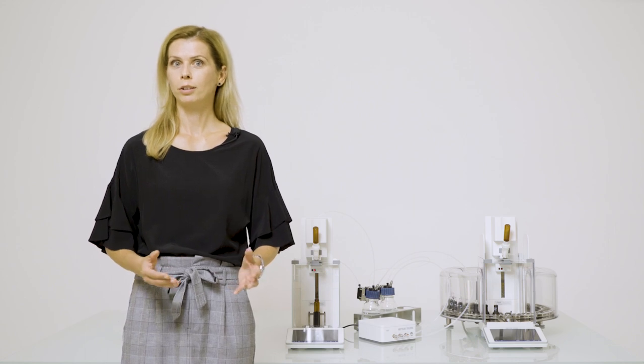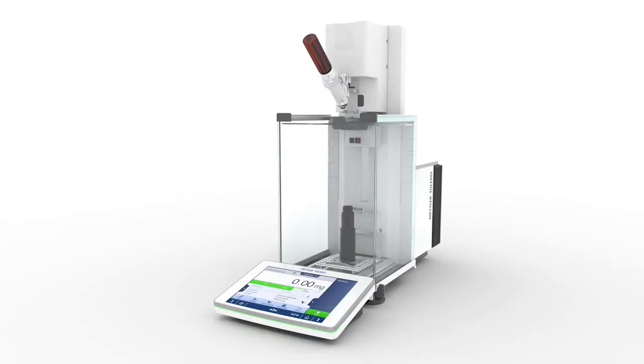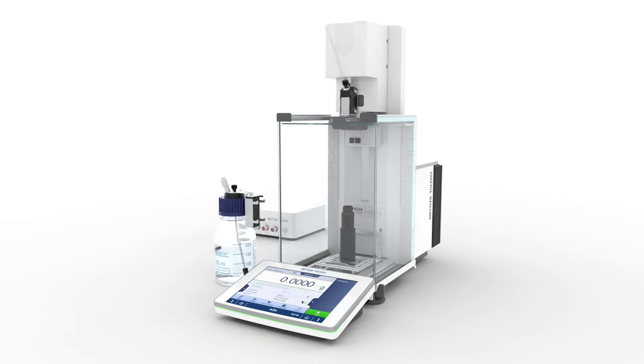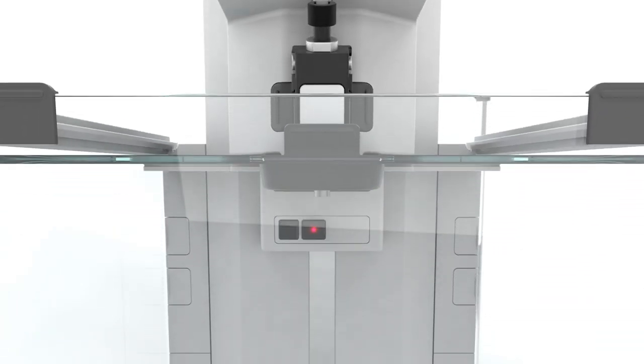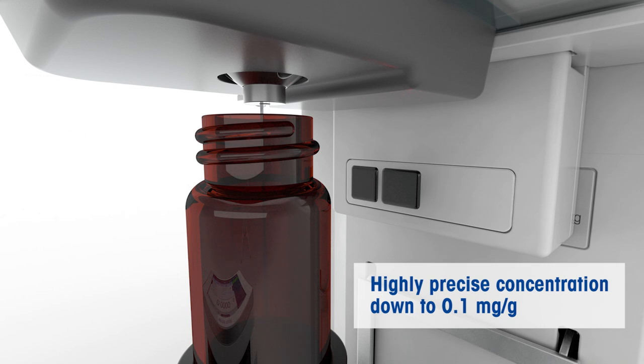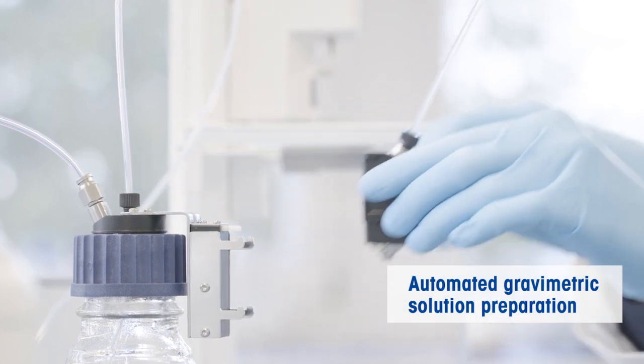With the XPR Automatic Balance, you can dispense not only powder but also liquid. Just change the dosing head and perform adding the solvent — it is so easy. This advantage is especially important if you need to prepare exact concentrations, even as low as 0.1 mg per gram. The XPR Automatic Balance is an ideal partner for highly accurate gravimetric solution preparation in just one step.